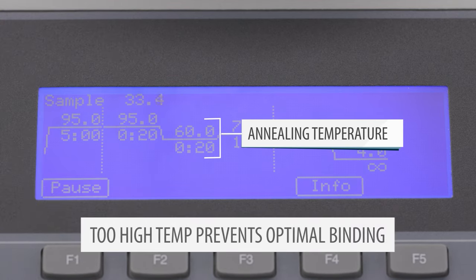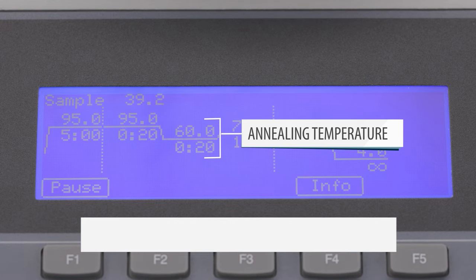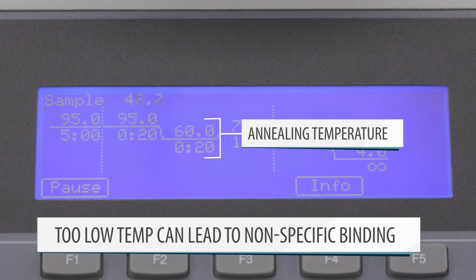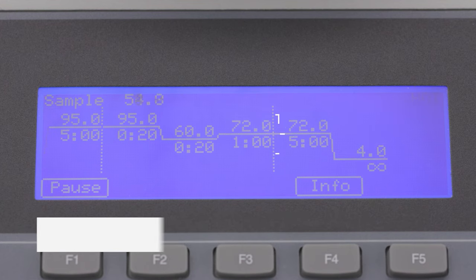Too high of an annealing temperature prevents optimal binding of the primers to the templates, while a temperature that is too low can lead to nonspecific binding and subsequently nonspecific PCR products.